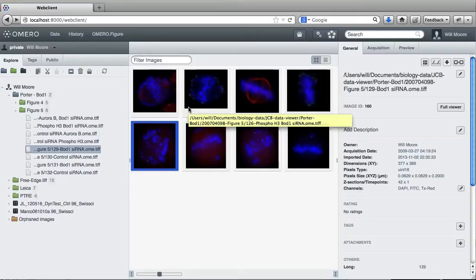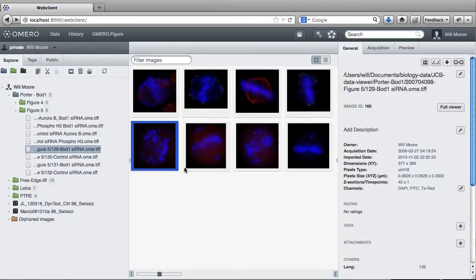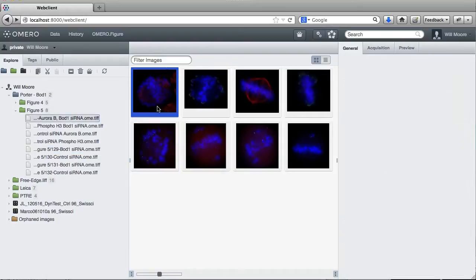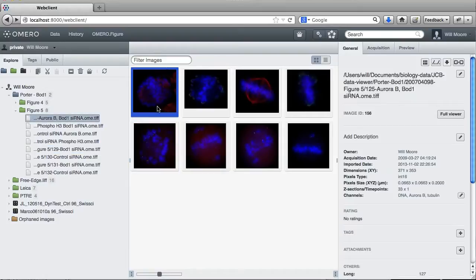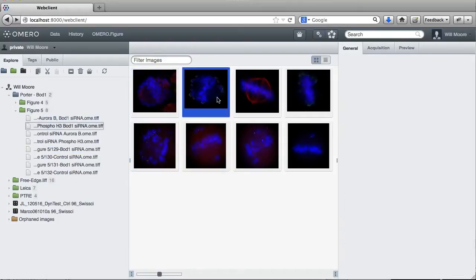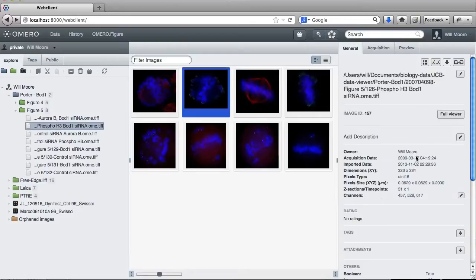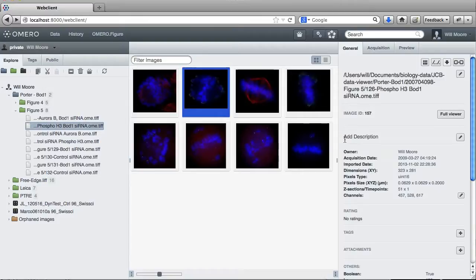I'm going to show you some figure generation functionality built on top of the Omero web client. For those of you familiar with Omero, you'll know you've got images that we can browse in the clients and a bunch of metadata for each one, things like channel name and pixel size and dimensions. We'll be using some of this later.